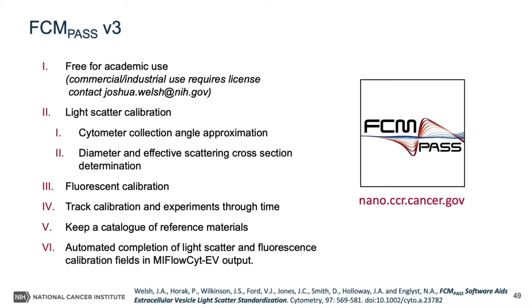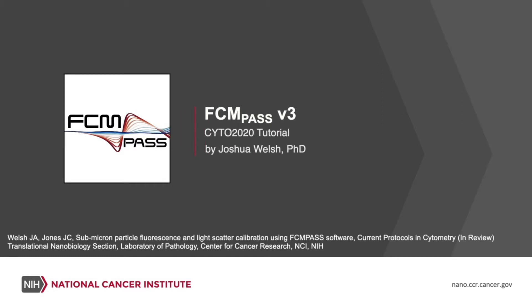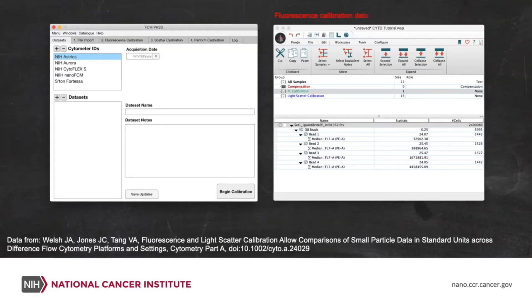FCMPass catalogues your reference materials so that their information will automatically be completed in your MyFlowSite EV report, saving you time. You're also able to keep records of your calibrations and experiments over time. So today I want to take you through calibrating a data set from start to finish with the FCMPass software. This is the new version 3 software.